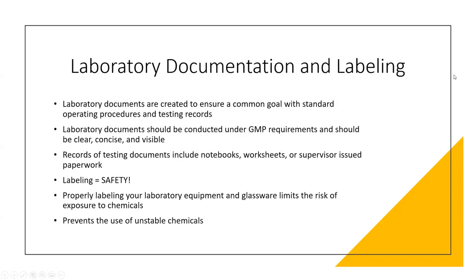All right, our next objective that we're moving on to is laboratory documentation and labeling. As we move through our GLP training, you'll notice how important it is to document everything and label everything. This will be a recurring theme throughout the rest of the training, but also throughout the rest of the curriculum. I know that you will either be going through GMP training before or after this module, but you'll hear this a lot with documentation.